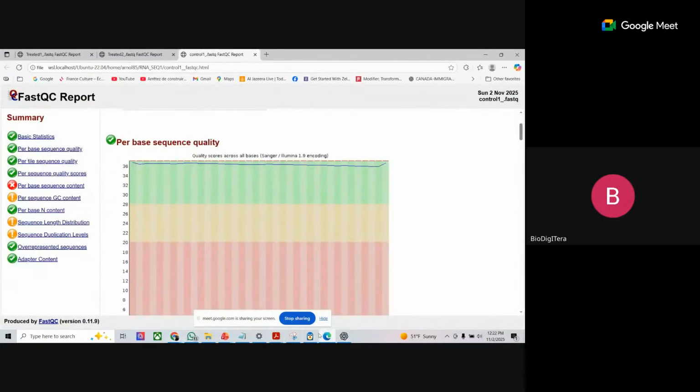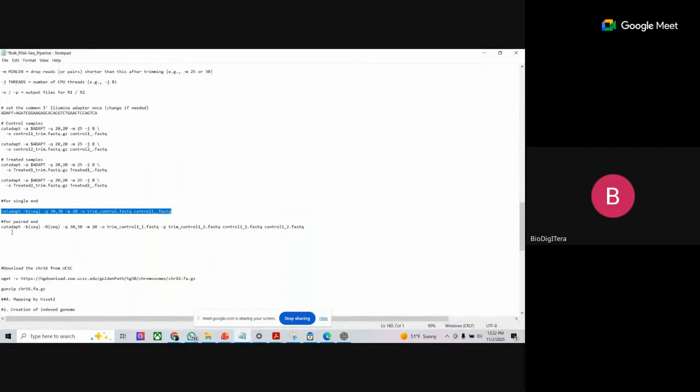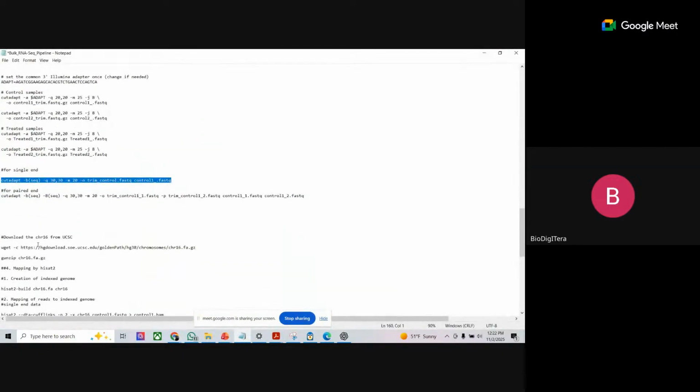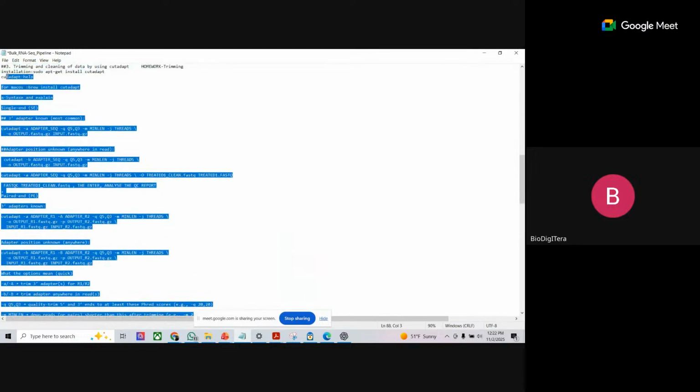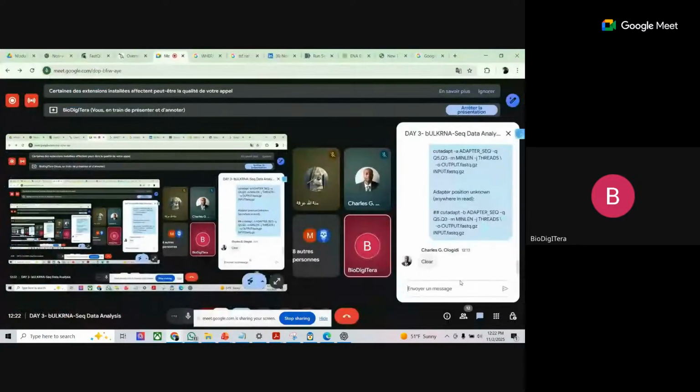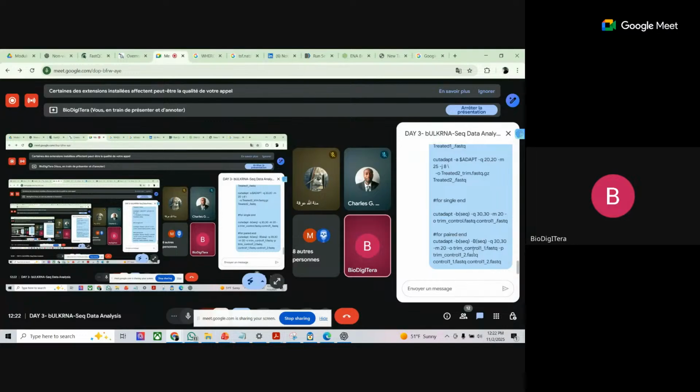Let me copy everything. Oh, okay. It is from here. Guys, this is trimming.